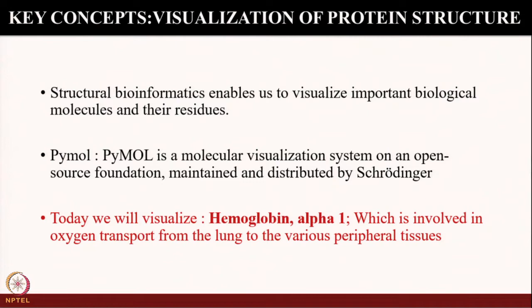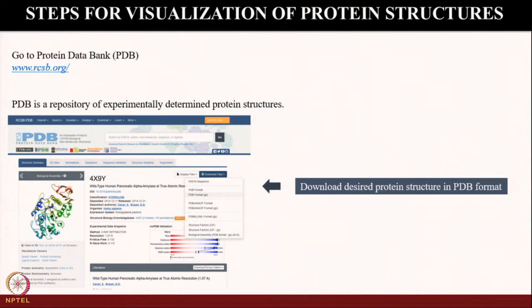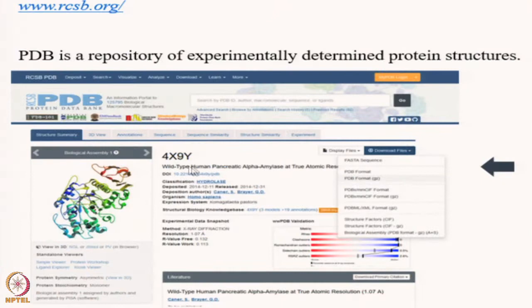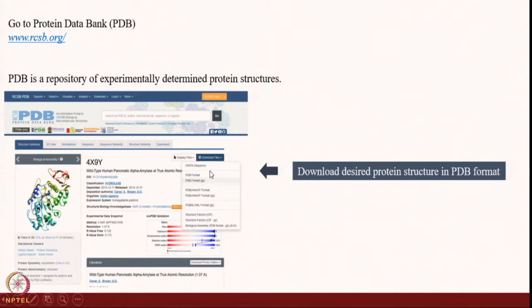As we all know, hemoglobin is an important molecule which is present in the blood and it is an oxygen carrier. So we will first go to the protein data bank. The protein data bank is an open database for protein structures which are experimentally determined. We can go and search for any protein and it will give a unique ID, also known as the PDB ID of the protein. After searching the protein of interest, in the download options you can see various formats of the protein structure.